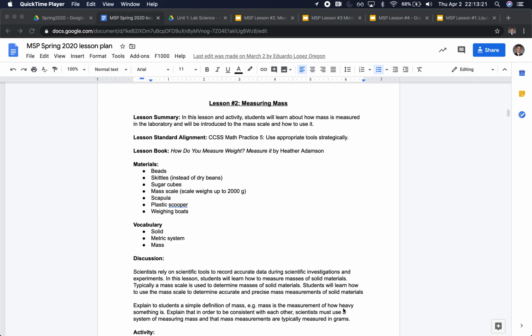I am an instructor for the JEP MSP program, and I'm going to be going through Lesson 2 of Unit 1, Laboratory Science. Lesson 2 is measuring mass. Last time, you did measuring volumes, so this is a similar activity and lesson in general, measuring mass.